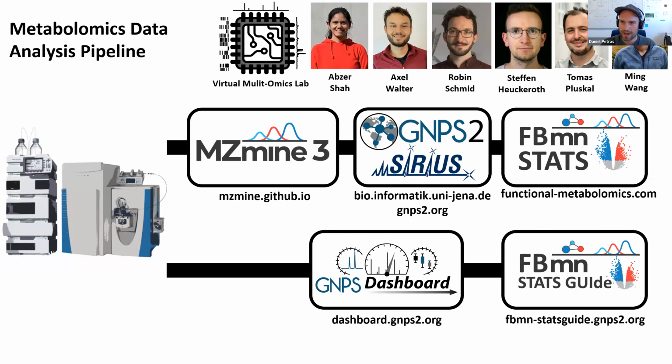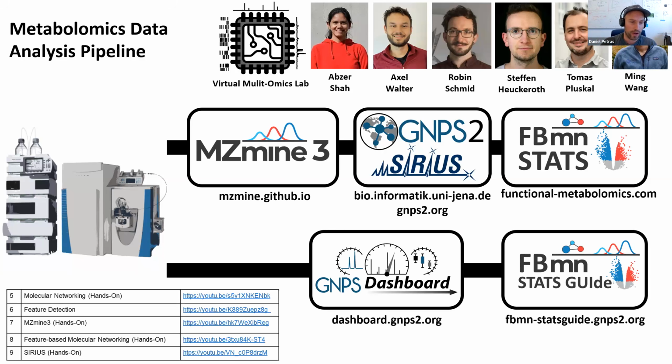So if you want to find out a little bit more of these different tools and possibilities, then please take a look. There have been also, as I mentioned, extensive seminars before, both from Tomasz and Robin on the feature finding side. Then myself, I did one on the feature-based molecular networking. And then I think Kai Dürkop from the Böcker Lab did also a hands-on tutorial on the use of Sirius.